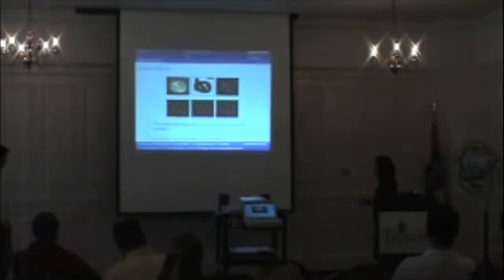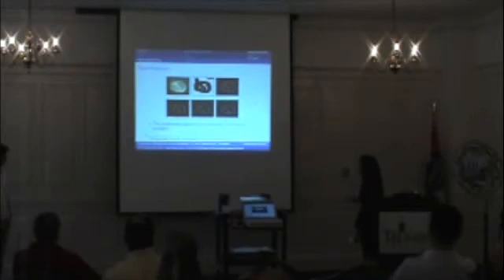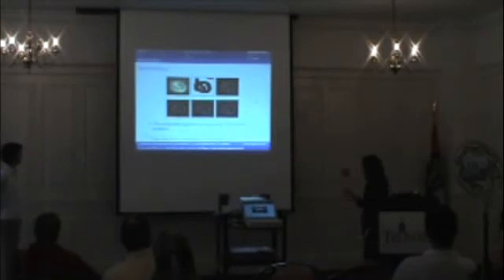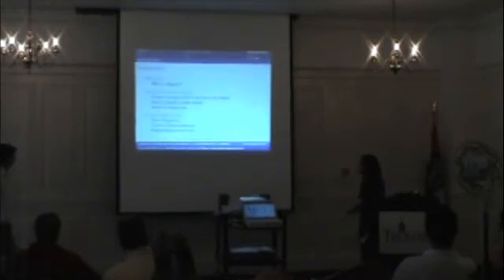So here, this is a great example of this picture. It's got a cell, which is kind of noisy, not that great. These are also fluorescent. They threshold it, and on the C right here, this is just the watershed, plain old garden variety watershed algorithm, which is close, but it's not great, as you can see. But after several iterations of this level set hybrid, you get a much cleaner, much nicer approximation, which is something we really want. And so in conclusion, we talked about motivation, accomplishments, and all these different techniques.